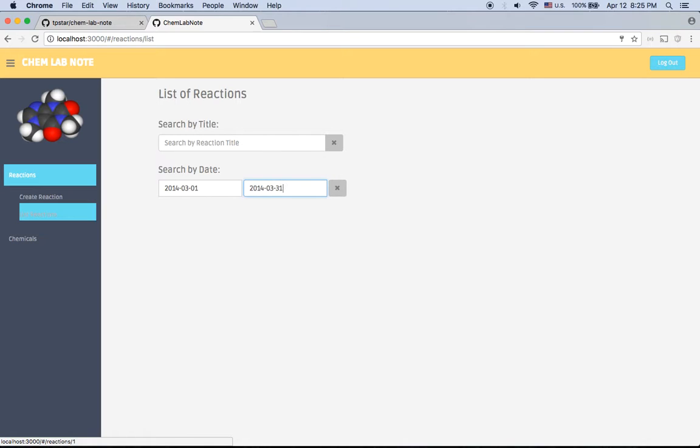So there are two reactions that were done in March, and then you provide some keyword.